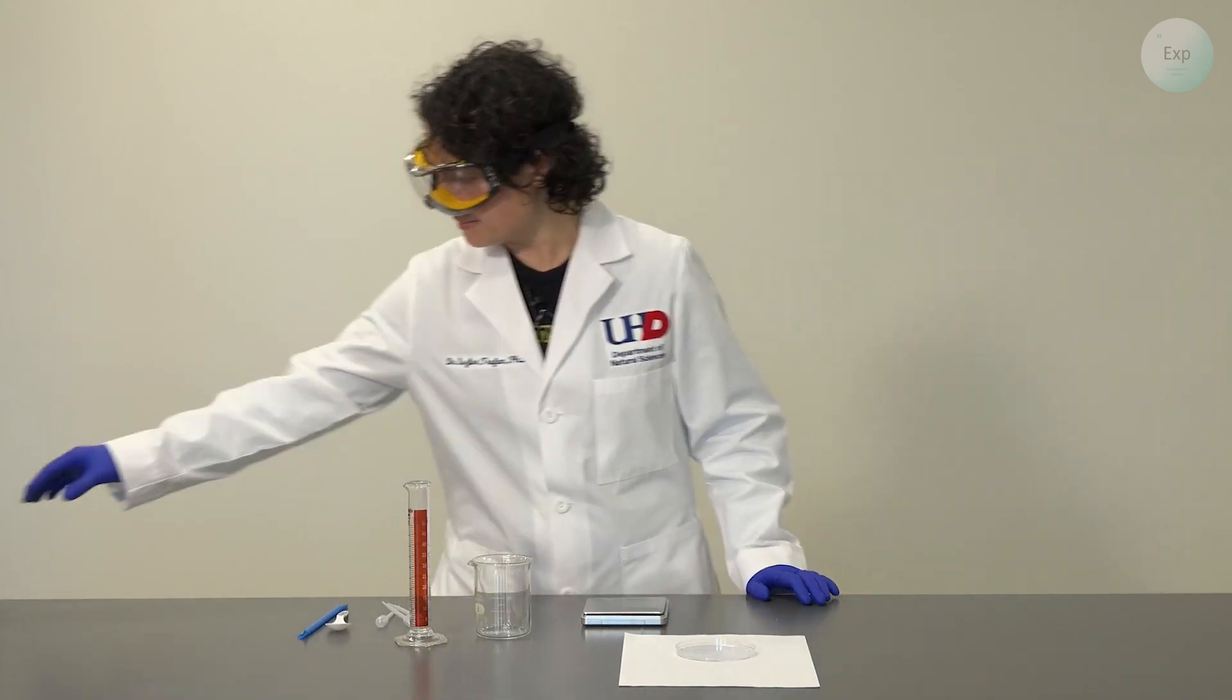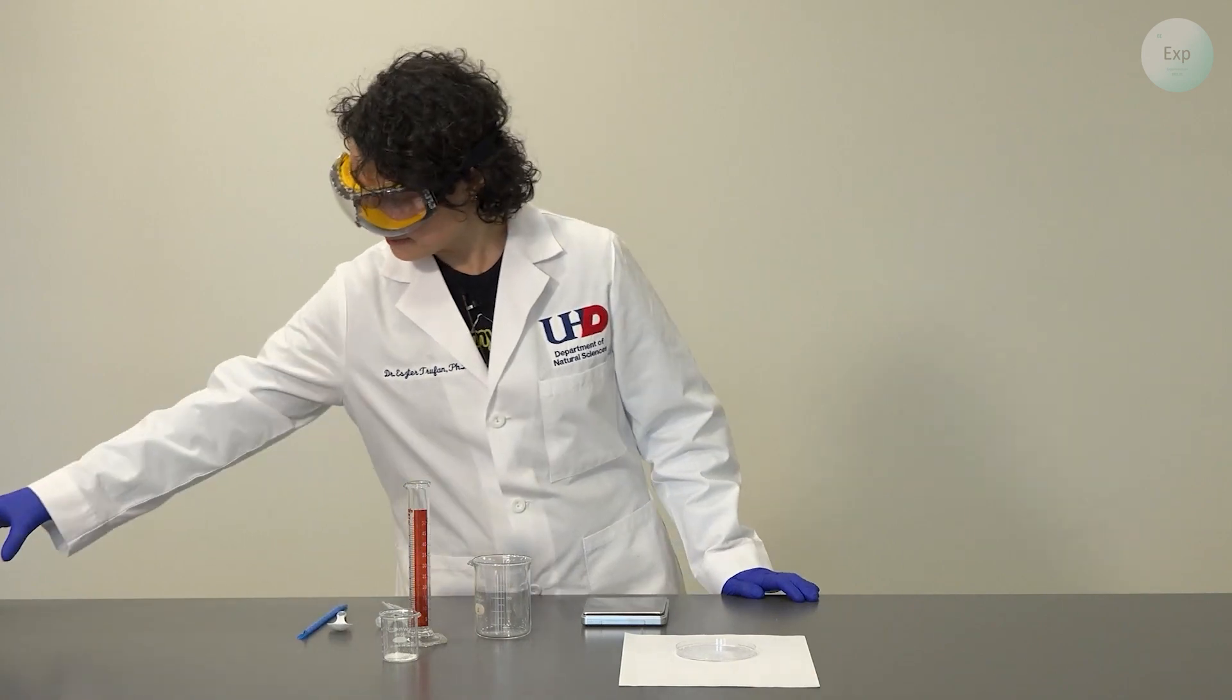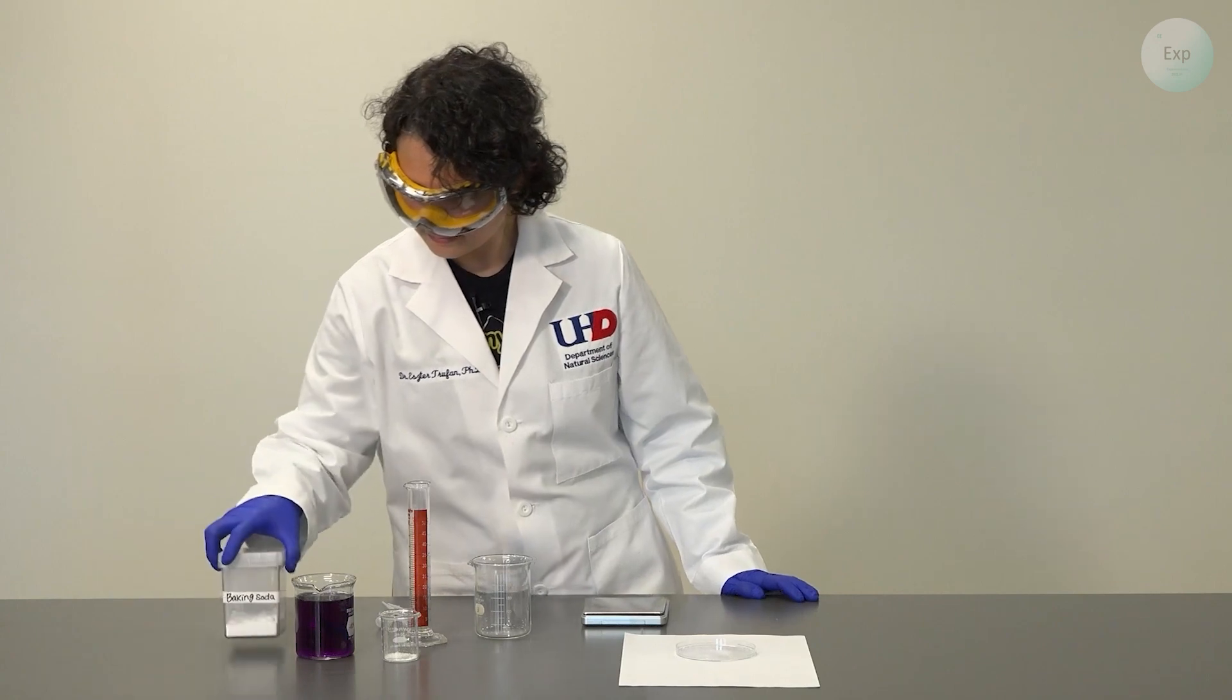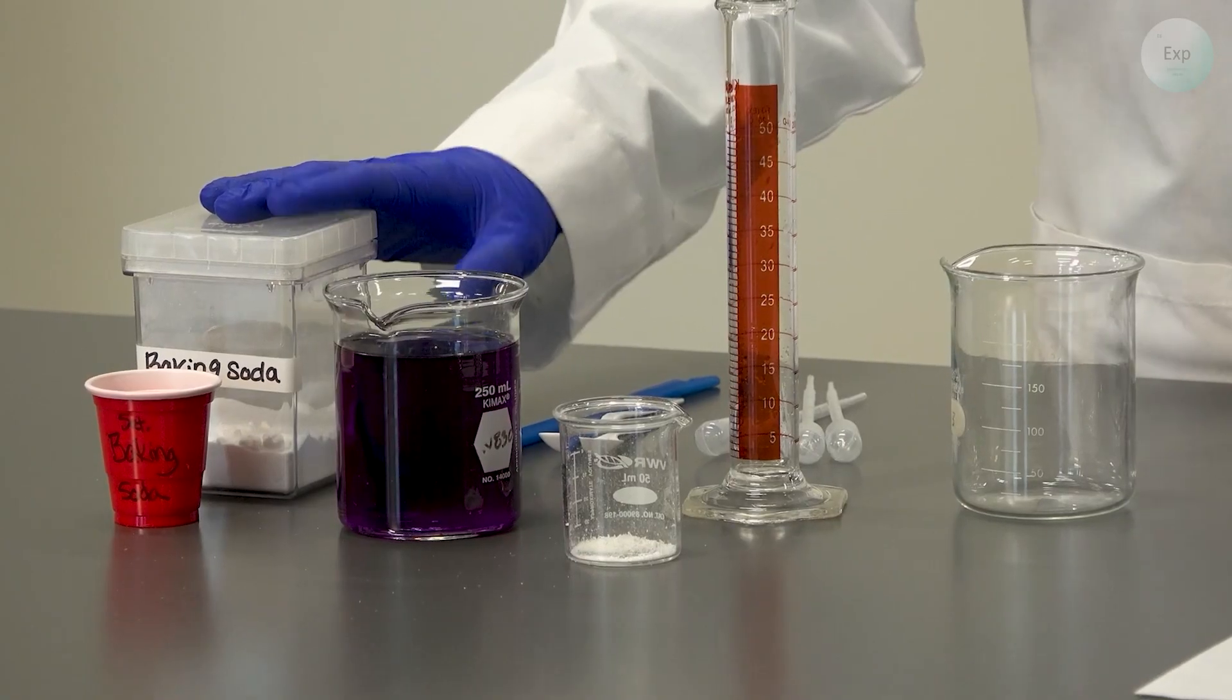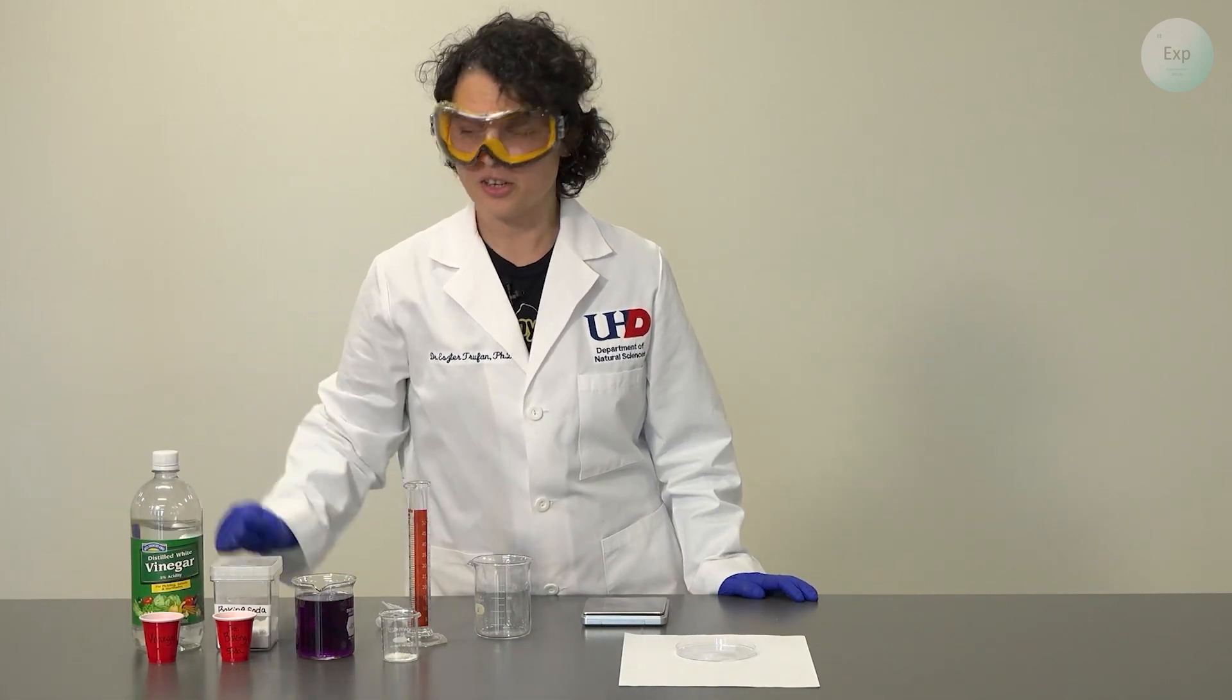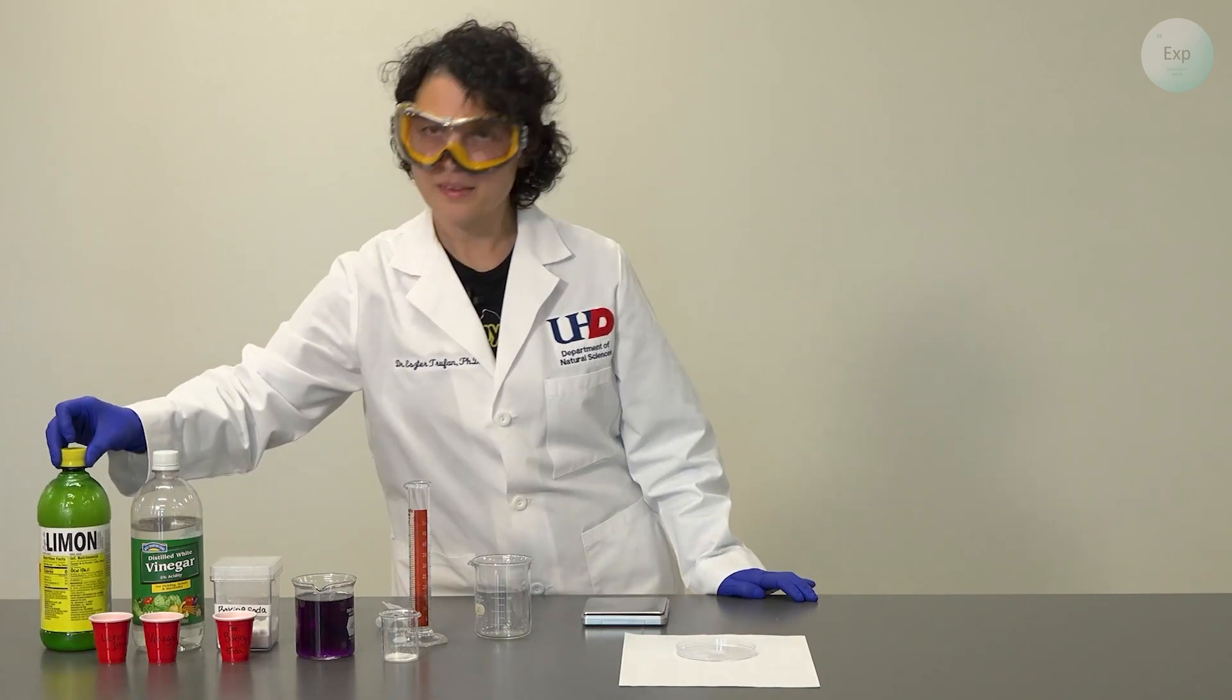On the chemical side we're going to need our diaper polymer, indicator solution, some baking soda solution, some vinegar, and some lemon juice.